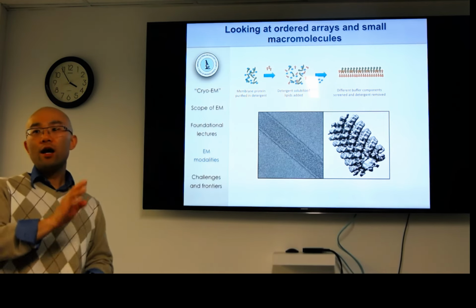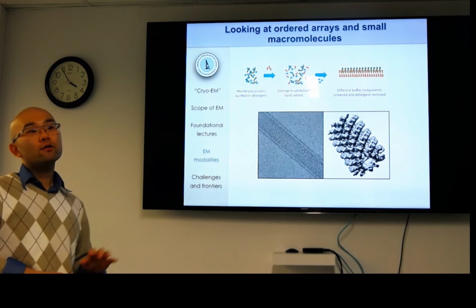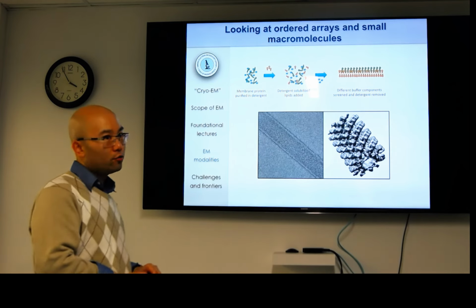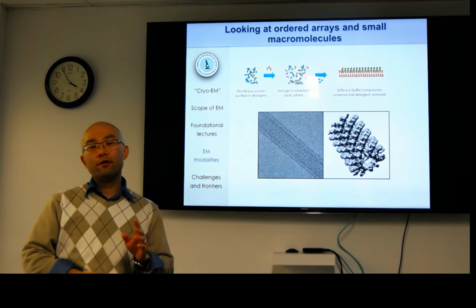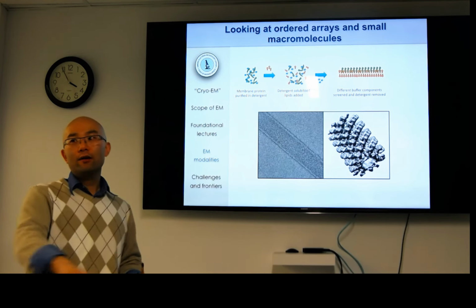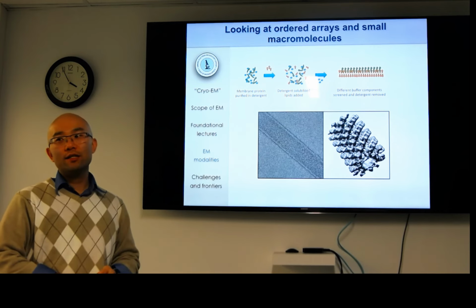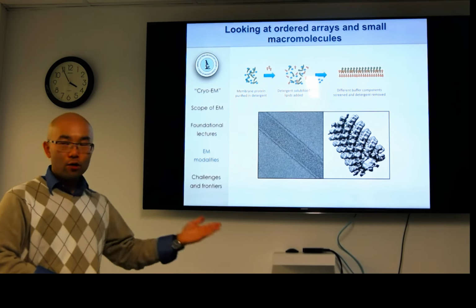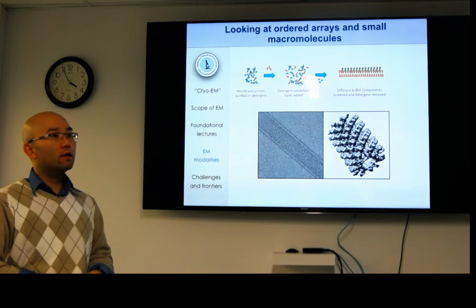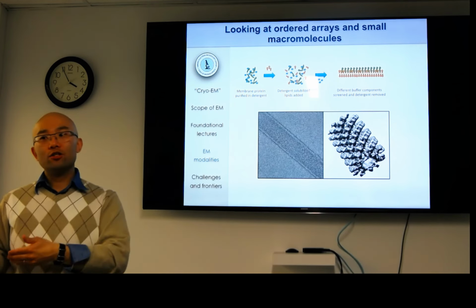Something that will not really be discussed in this lecture, but we're moving towards, is another technique using diffraction, that's micro-ED, and a lot of crystallographers are interested in that because you can form microcrystals, and then you can use the electron microscope just by taking out the projection lenses as in diffraction. So you can take electron diffraction images and go through the same X-ray crystallography packages. And with that, people have shown within the past few years you can get atomic resolution with biological samples.